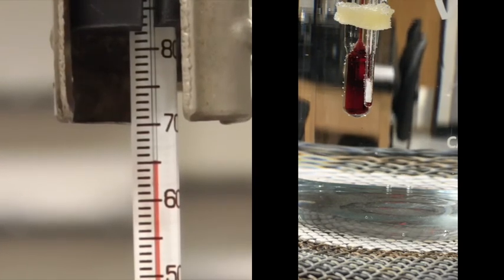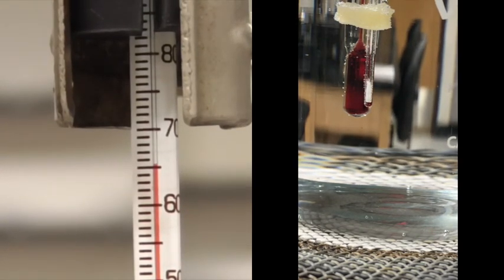There we go. Put the heat back on there. Bunsen burner back underneath.